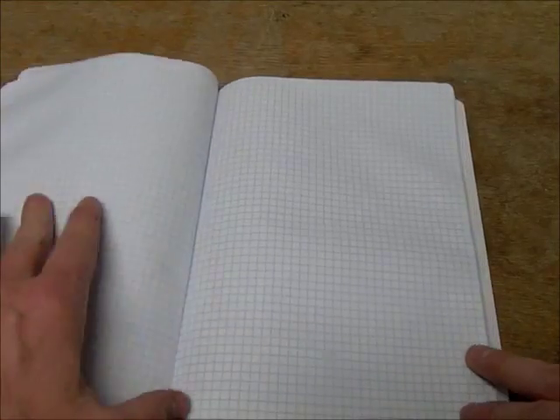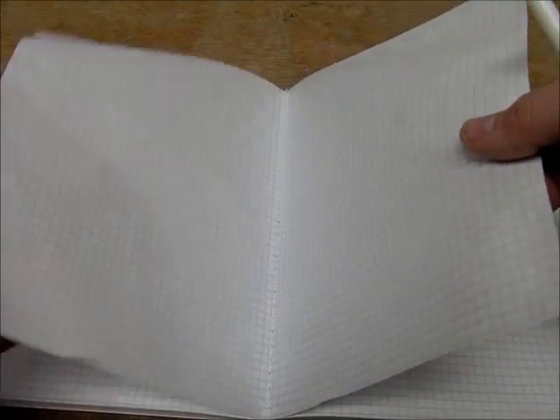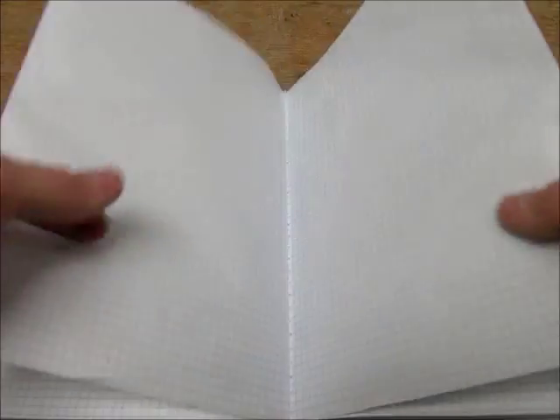The reason I mention that it's required that the pages are sewn in, if we flip to the very center of the notebook, you can see the very center has this sewn line right going down the center. That means this piece of paper and this piece of paper is actually one long sheet of paper with the sew line right down the middle. Which means if I tear out this side, this other page is going to fall out as well. So you cannot tear any of the pages out of this notebook.